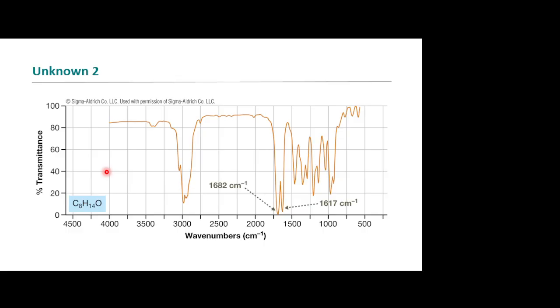We found out that we have hydrogens that are attached to a double bond, right? A carbon-carbon double bond of some sort. And so that actually gives us a lot of hints, right? Okay, so what else can we look for? Are there any other places on here that we could look, perhaps, to see what type of double bond we have? Or if we have a ring, or what's going on here?